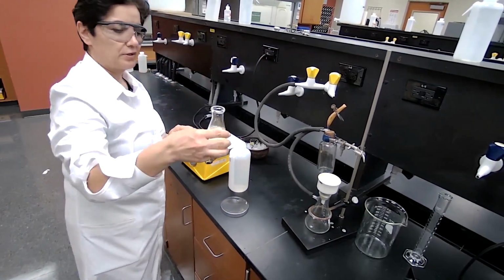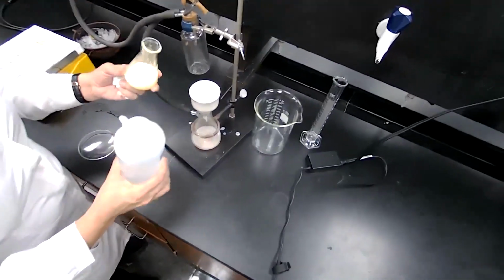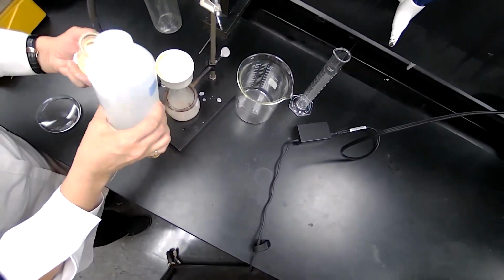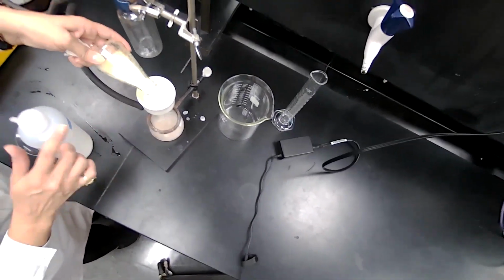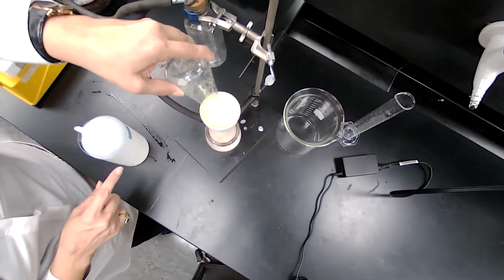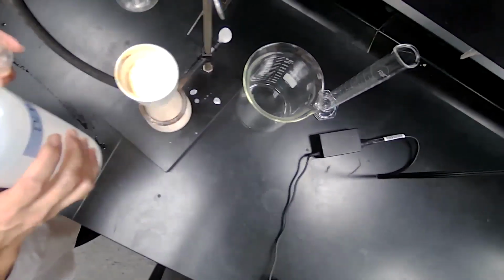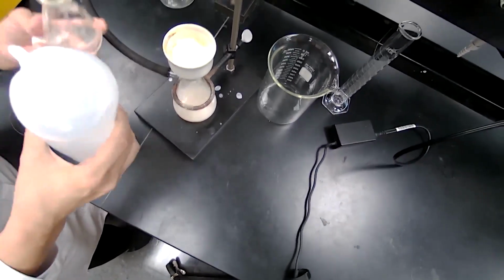We're going to pour the mixture over the filter paper. Can add some water for better transfer of the solid. We want to make sure that all the solid is transferred. And before even all the solid was transferred, I added the water just to make sure that I'm going to get most of the extra base, the sodium hydroxide that was mixed with this, washed away. So I add plenty of water.